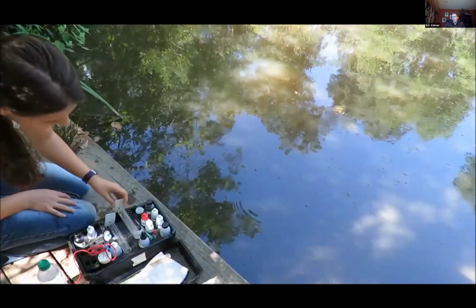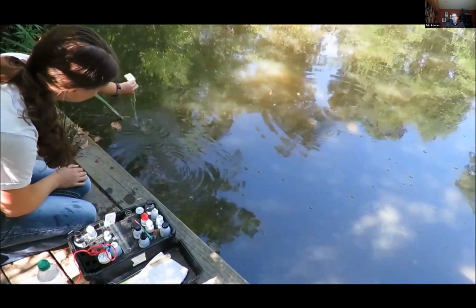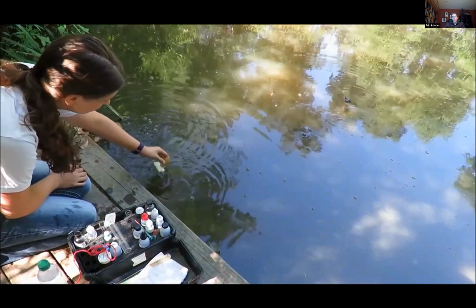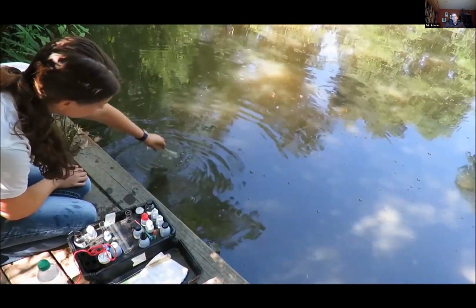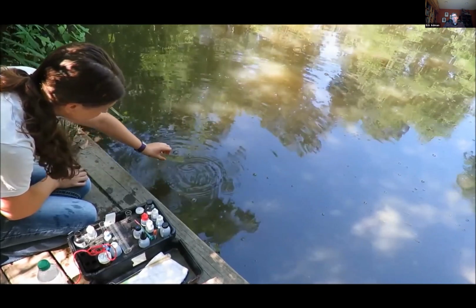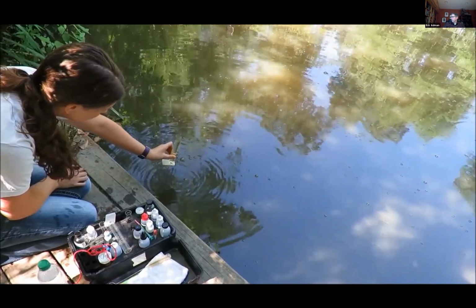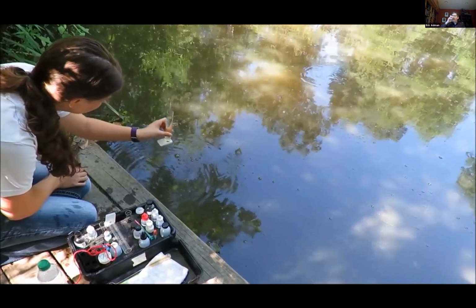Locate the turbidity columns in your kit. Fill one column to the 50 milliliter line with sample water. Look down through the column and locate the black dot on the bottom. If the dot is not visible, empty and refill the column to the 25 milliliter line. If the dot is still not visible, record turbidity as too high to measure, or THTM, in the comments section of your data form.